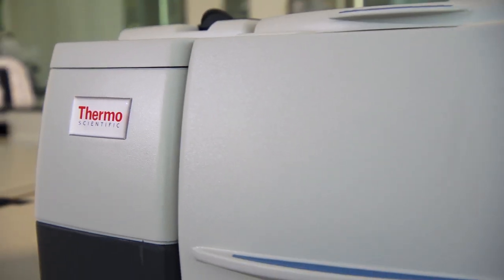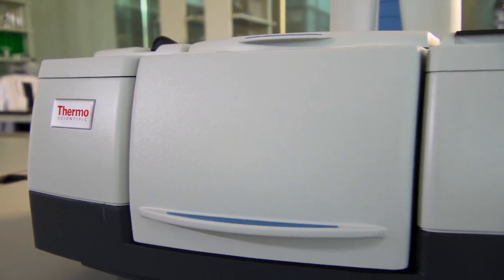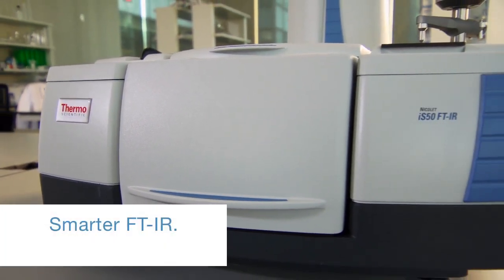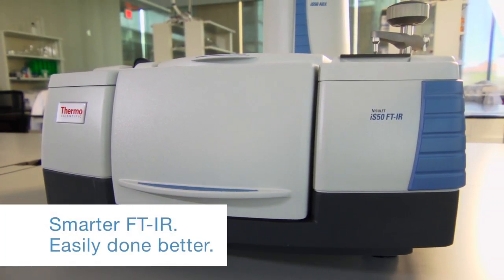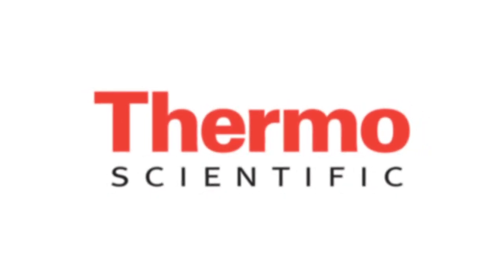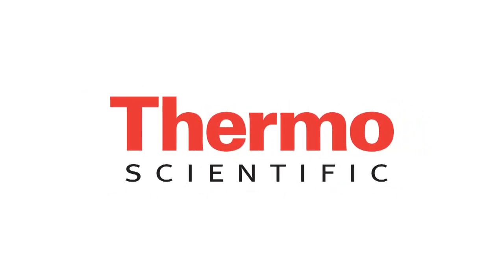The Nicolet IS50 Materials Analysis Workstation. Smarter FTIR, easily done better. Contact your local Thermo Scientific FTIR sales representative or go to thermoscientific.com/IS50 to view videos and download technical information.